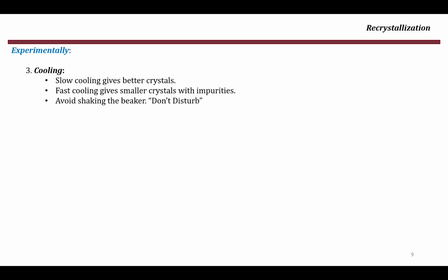And of course, once you leave your beaker aside, avoid shaking it, don't disturb it, because shaking it may cause the crystals to form quickly and then the impurities will be inside.